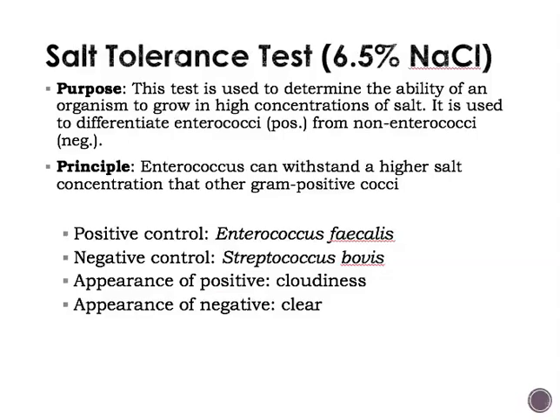Okay, and again, we're doing this in conjunction with the salt tolerance test. So this test is used to determine the ability of an organism to grow in high concentrations of salt. It can be used to differentiate Enterococcus from non-Enterococcus and to differentiate Enterococcus from group D.